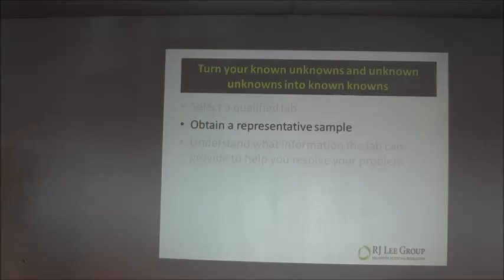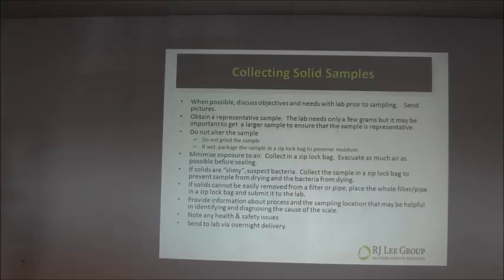Okay, one thing I want to spend a little bit of time here is talking about obtaining a representative sample. This is unbelievably important and really shortchanged in the industry. So I want to take a couple slides and just work down through this. I apologize, the slide's a little busy, so I was going to go through it step by step. And when you're collecting solid samples, or collecting any samples, first thing I would ask you to do, if you can possibly do it, is talk with your lab. They're going to help you through this. They're going to have a knowledge of how the samples should be collected, how much they need, all those details that will help them give you the best results in the end.